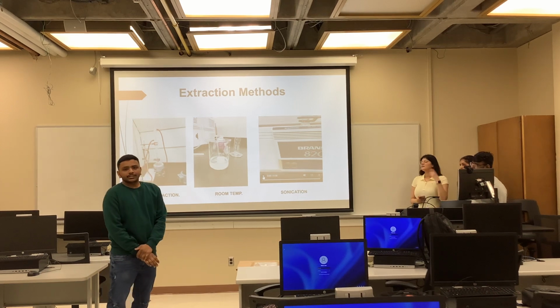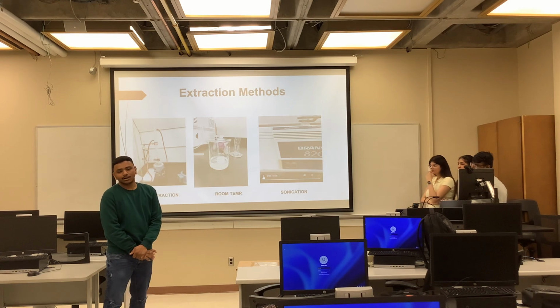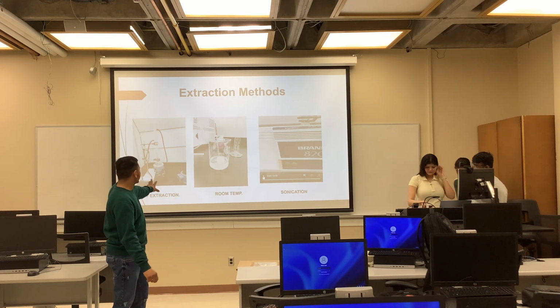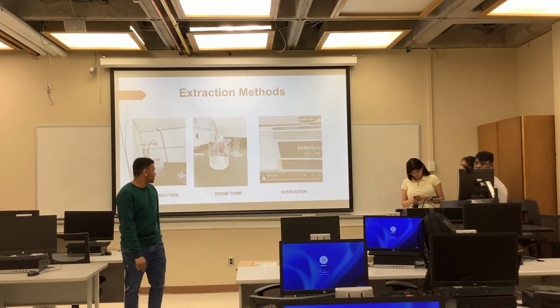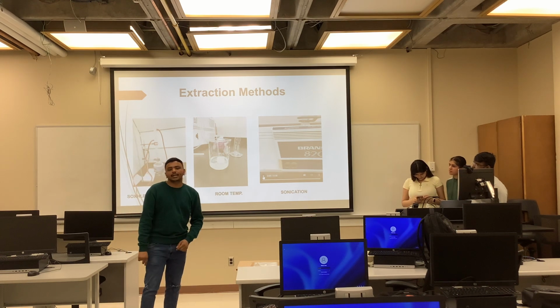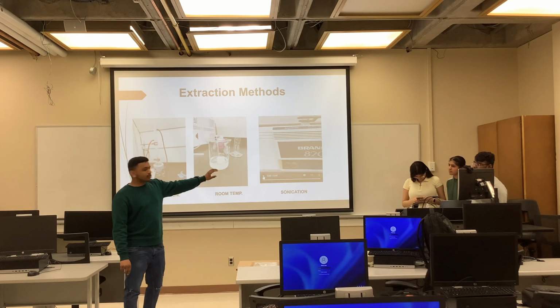As we already wasted 2 weeks selecting the best trial method, we were not able to follow our work plan. So to complete by the deadline, we decided to do the Soxhlet extraction and the room temperature method together simultaneously. The sonication was not available at that time, so we did that method later on.